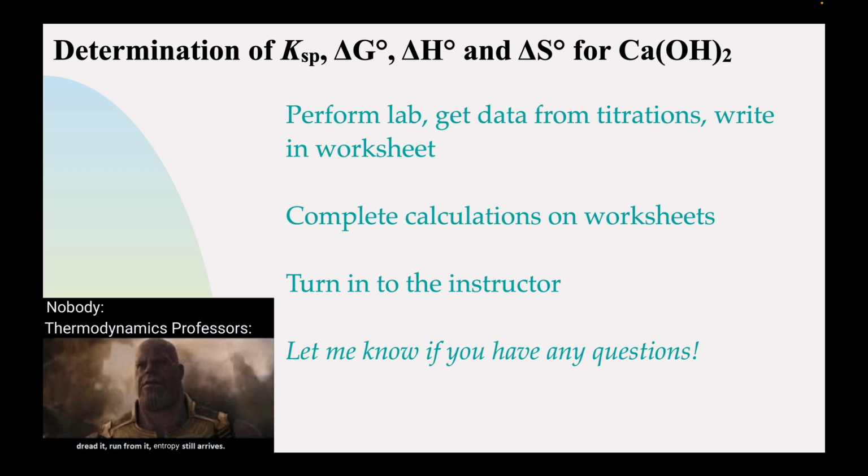So again, you can write all this data in your worksheets and then work on it later at home if you'd like. Show example calculations of how this works out, and then you'll turn it in to me the next time we meet in lab. If you have any questions, of course, reach out to me. I know this can be a little weird, but it's a pretty powerful technique, and you can find entropy and enthalpy for these kind of situations, which is really cool. Just kind of go with it and see what you find.